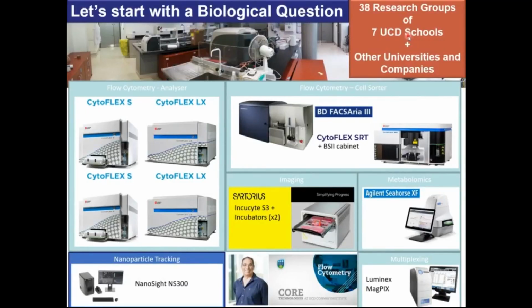But you can see there that there's only one person, and that's because I have to run all of these. So what we do, as James pointed out, is education, education, education. I try to make sure that all the users know how to use the instruments from the beginning to the end. They can turn on, they can turn off, they have to clean and operate and even troubleshoot the instruments.